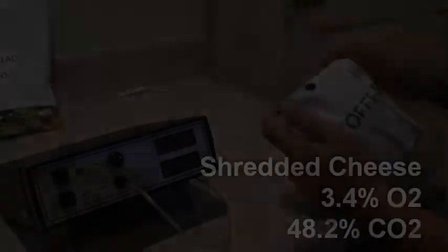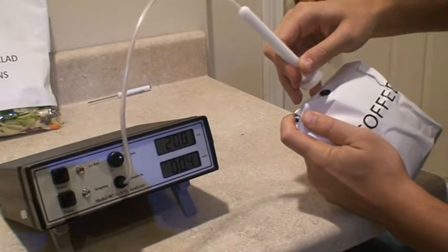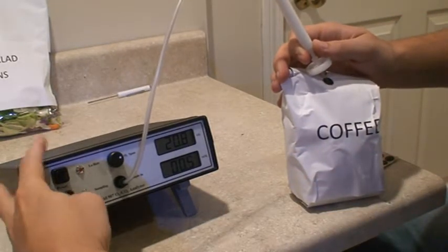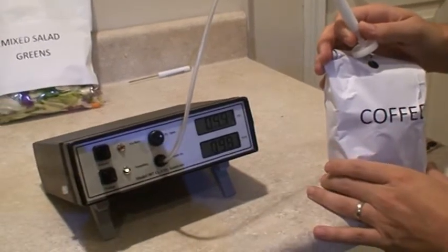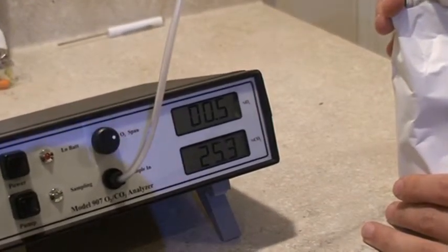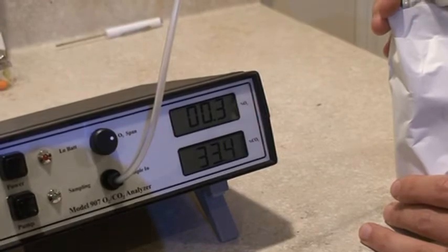Next we're going to move on and sample a package of coffee. Insert the needle into the package and press the pump button. As you can see, the oxygen readings are going down, which is what we would expect for a package of coffee, and the CO2 readings for this package came out around 33%.